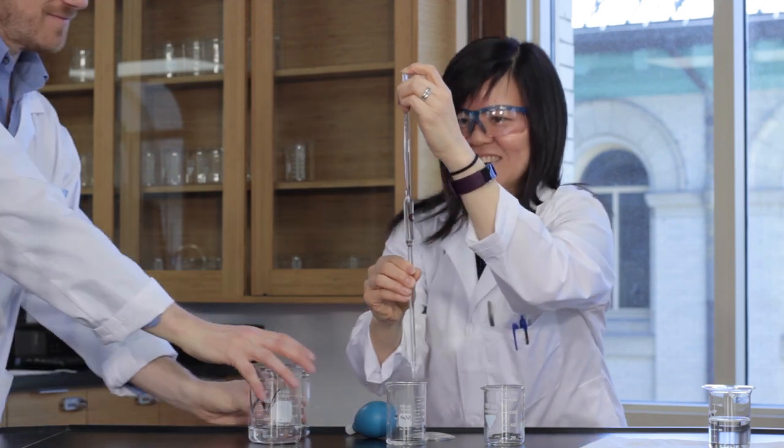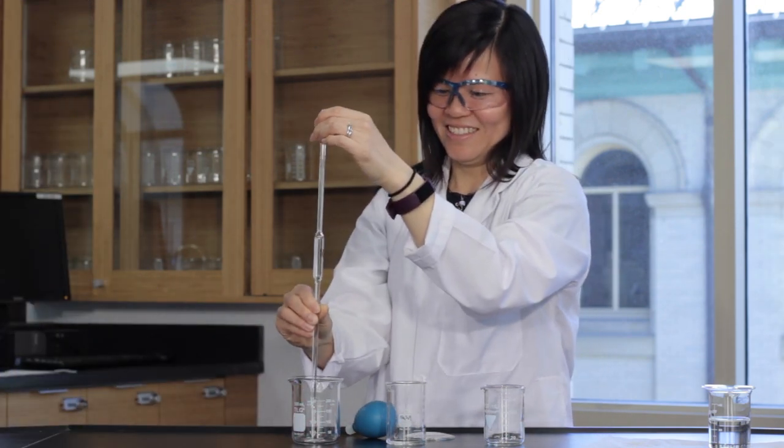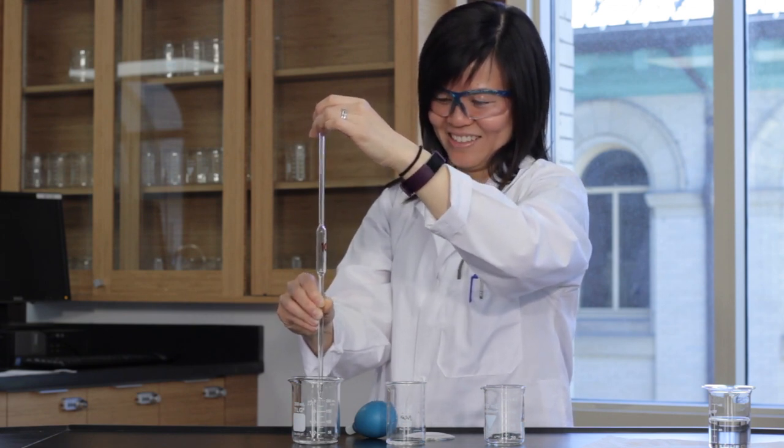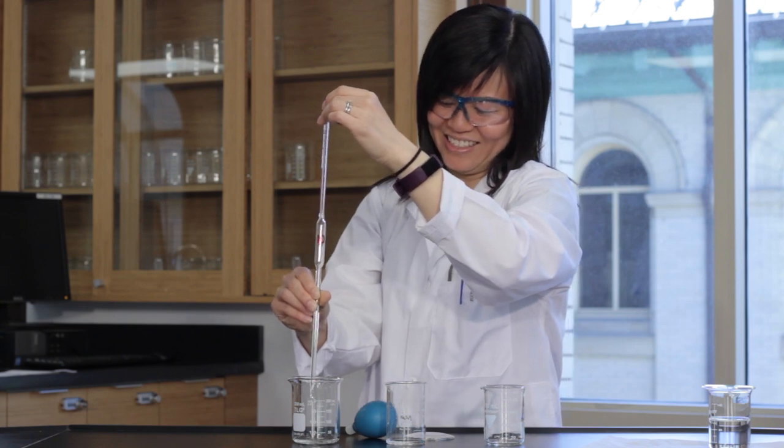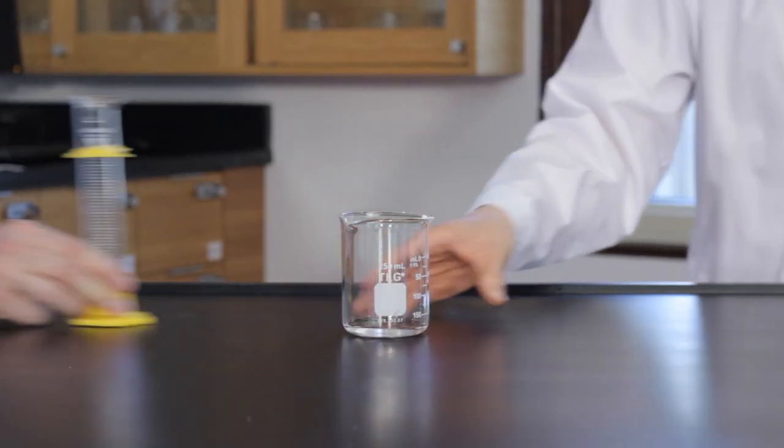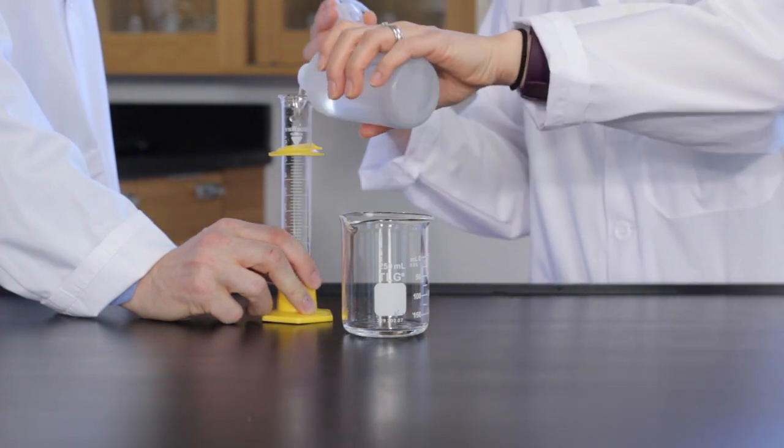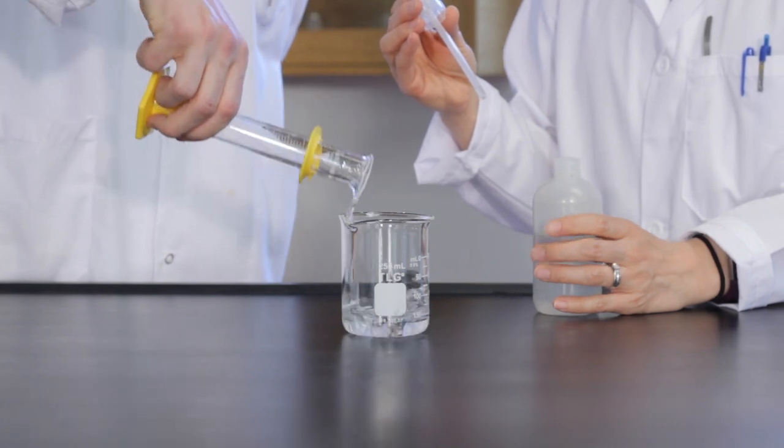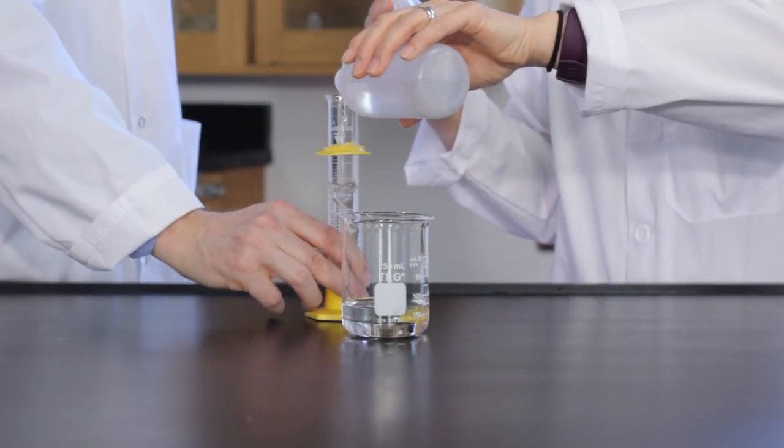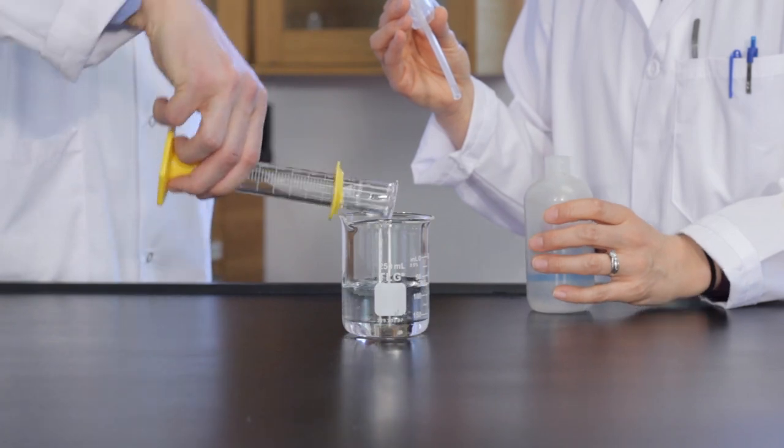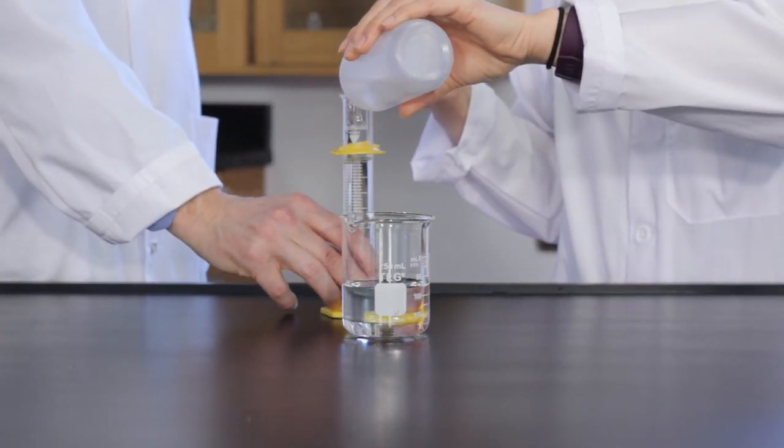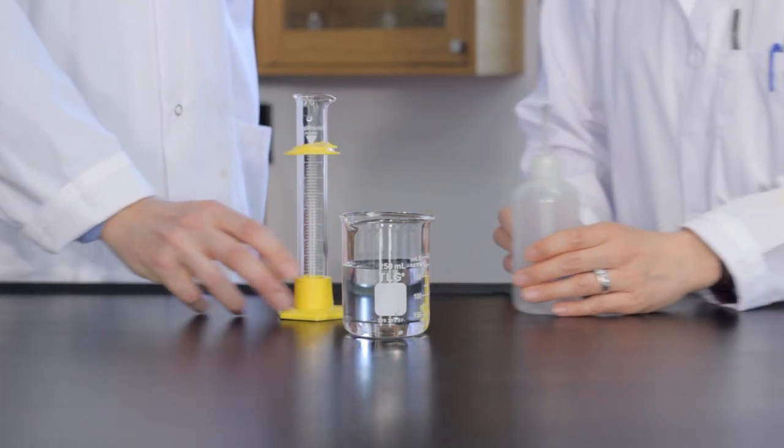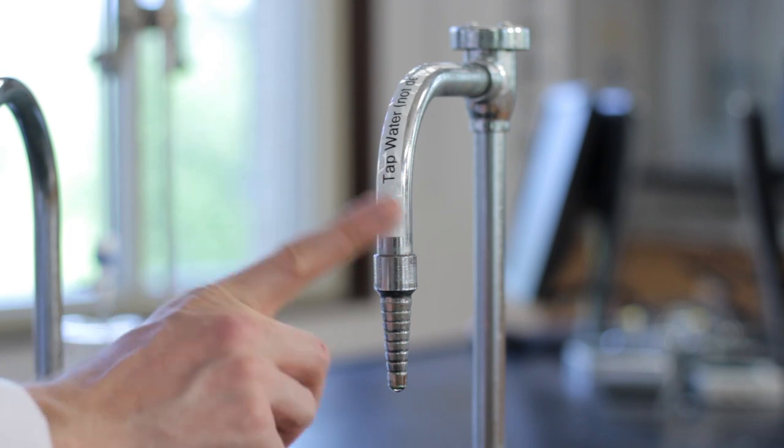Measure 10 milliliters of hydrochloric acid and transfer it into a clean 250 milliliter beaker. Add approximately 150 milliliters of distilled water to the beaker then set it aside. Be sure to use the appropriate tap.